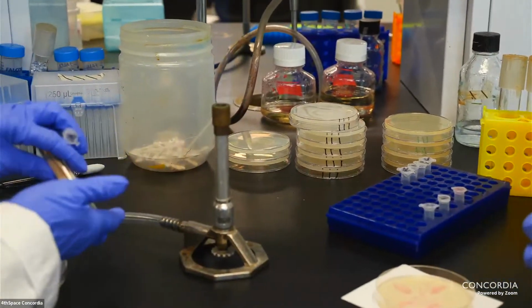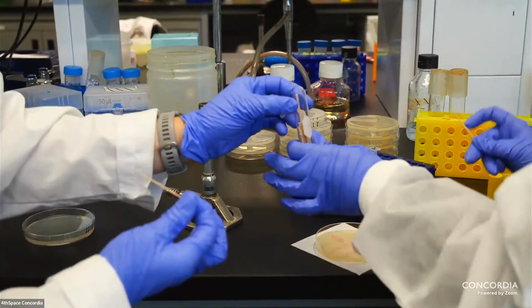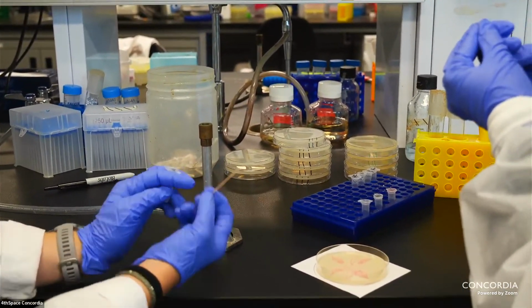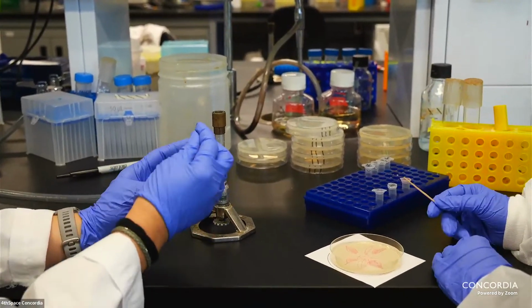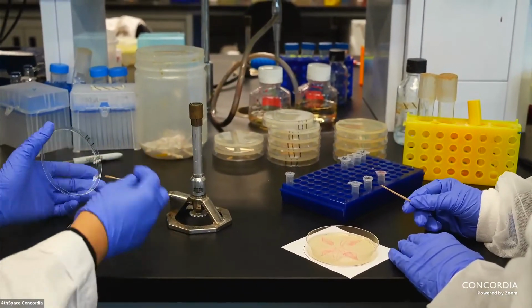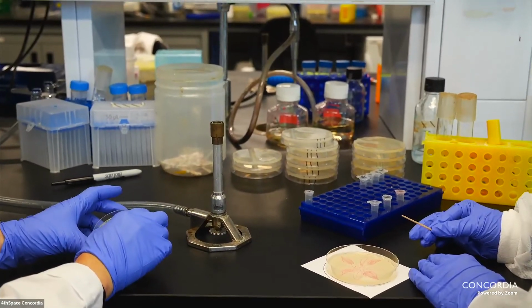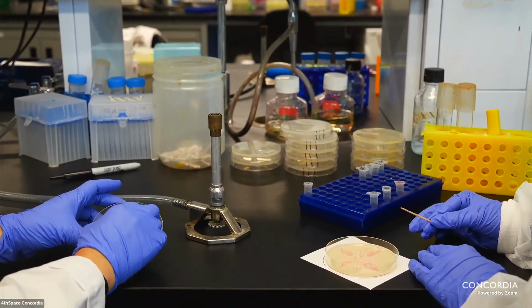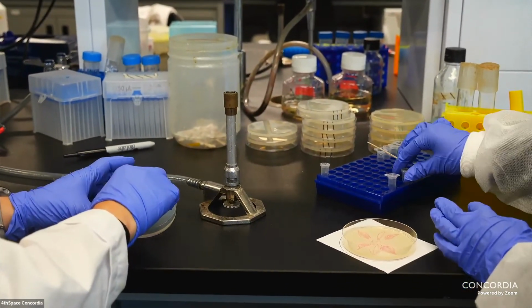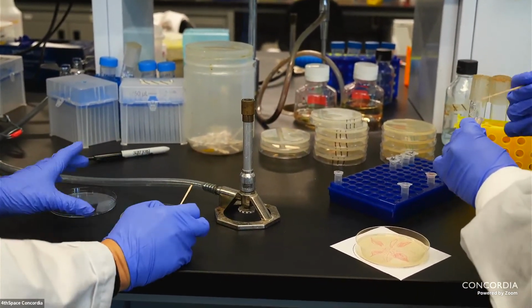So you can see that there's the end that's sort of not so pointy. So dip it in. And you don't want to go like this. You kind of just want to use the side and just touch very lightly at first to get a feel for it. And then you have to go very light because if you go even a little bit, you stab it. Yeah, see, like that. So just very light on the surface like that, and you'll see your streak.